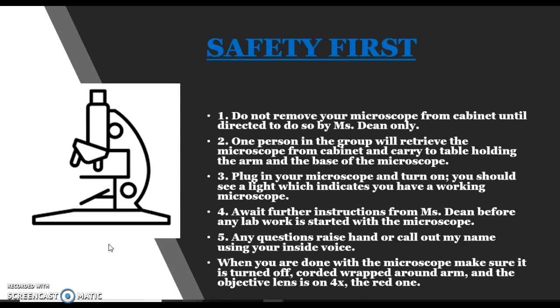Safety is first, always. Please read, learn, and know, because you will be expected to abide by the posted rules. Rules 1 through 5 explain the use of the microscope, and the last section explains what to do once you've completed using your microscope.